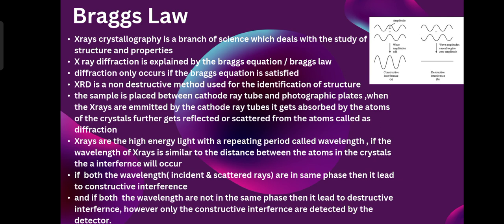So XRD, that is X-ray diffraction, is a non-destructive method which is useful for identification of the structure and its arrangement in space. Here, non-destructive means it doesn't modify the crystal structure. Without changing the structure or doing any processing to the crystal, we can find its internal molecular structure.